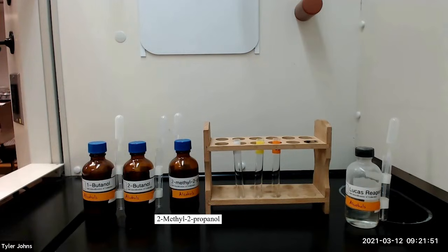The Lucas test does not work well with solid alcohols or liquid alcohols containing 6 or more carbons.